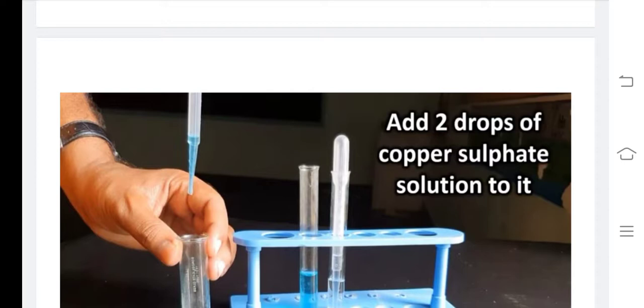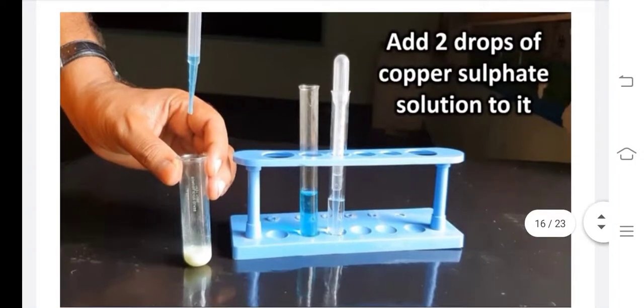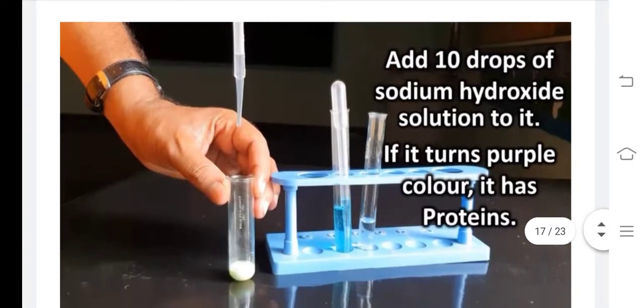One is copper sulfate solution, children. Another one is, what is the formula of copper sulfate? Once again, CuSO4. Clear children? And what about caustic soda or sodium hydroxide? NaOH. Clear? Add 2 drops. They have taken powdered gram flour, pasted, by adding water. Add 2 drops of copper sulfate solution. I hope you understand. Observe, what is that one? In addition to that, one more, caustic soda or sodium hydroxide solution to it.